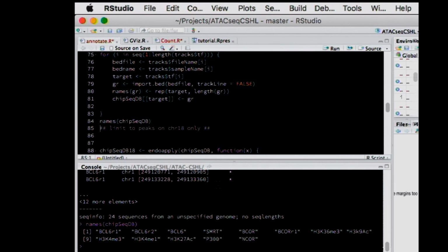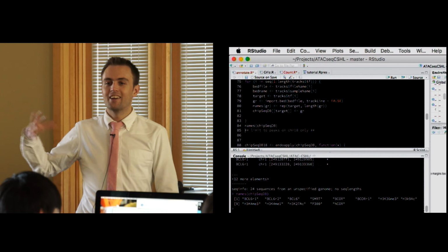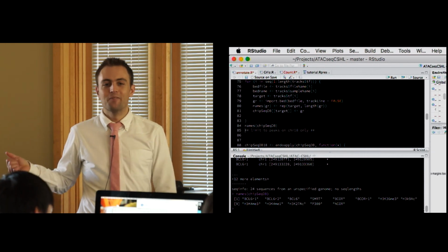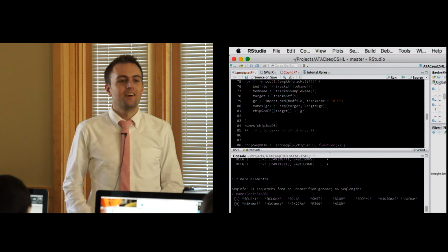With ATAC-seq, you only need 500 or 5,000 cells at a minimum. Usually it's more like 50,000, but that's super low. For ChIP-seq, you need 50 million, and that's right out of the incubator with the best lab technique.